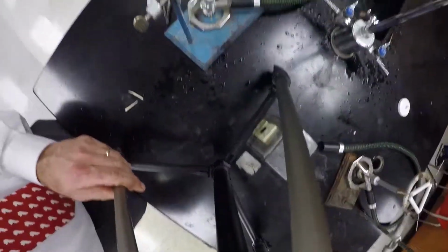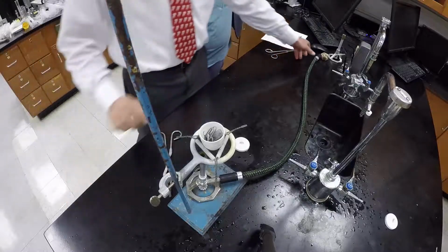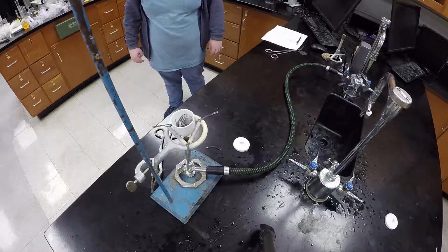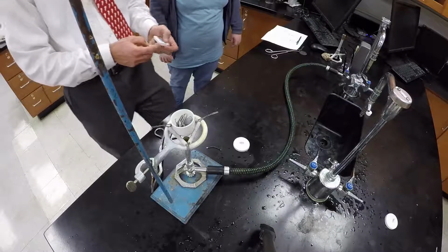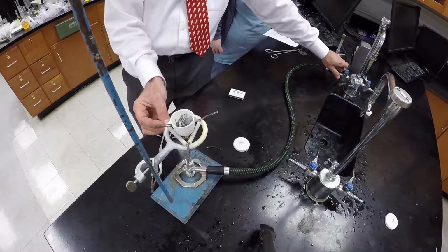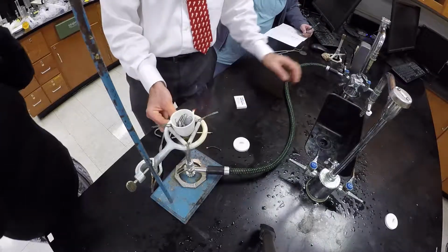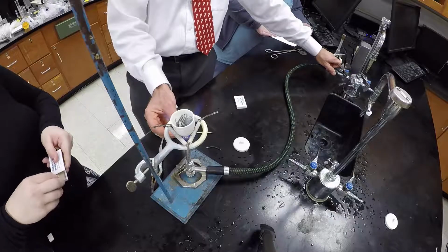Light the gas. Typically, we light the match and then we turn the gas on. So we have our match. Here's our gas. So move this over just a tad. And we're going to get some matches. So we will light the match, and then we turn the gas on. Went out. Often we go from the bottom up. So I'm going to just do that. See how we got it lit there.